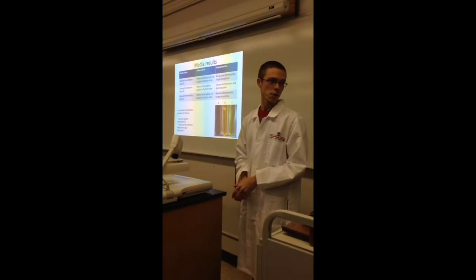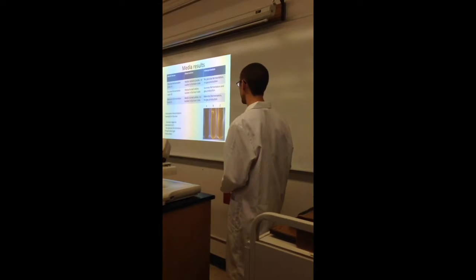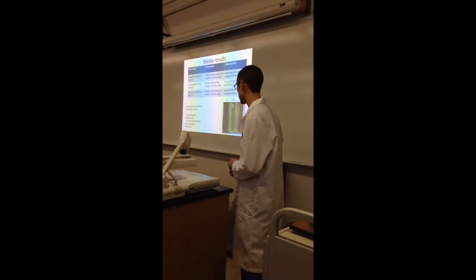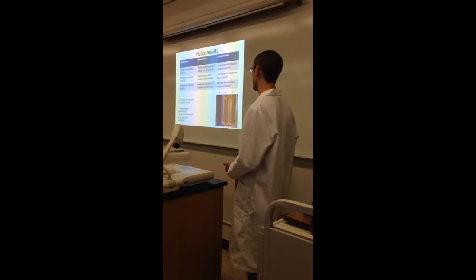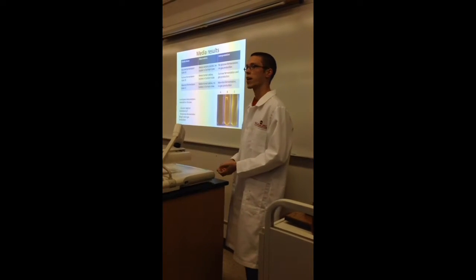But this is another example of where you can get tripped up by only providing a partial interpretation. So if you just say, for A, if this is glucose, glucose negative, that's only part of what you're looking at. You want to say that glucose is not fermented and that no gas is produced. So you have to remember that you're looking at both fermentation and gas production.